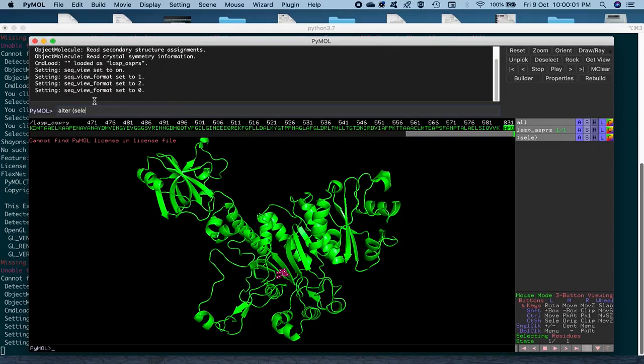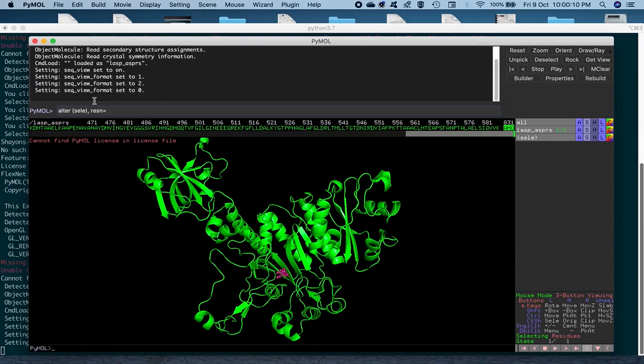Comma, R-E-S-N, that's the short form for residue name, is equal to A-S-P. And you press Enter.